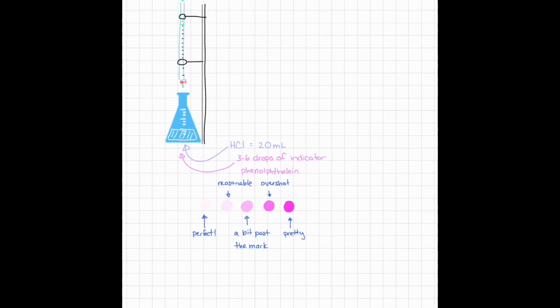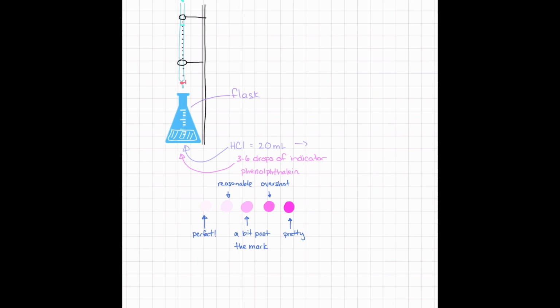So I'm gonna go over titration and titration curves with you. To set up your titration, or actually just the reaction, you usually have your flask, which would be this here. In that flask, you'll have a known amount of HCl, but you won't know its molarity per se. The point of a titration curve is to see how strong your acids or bases are.